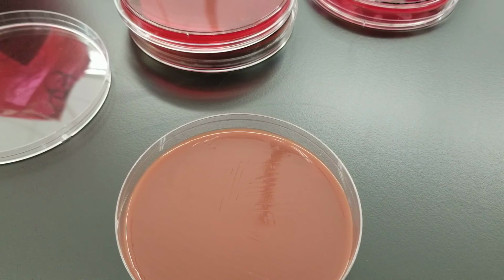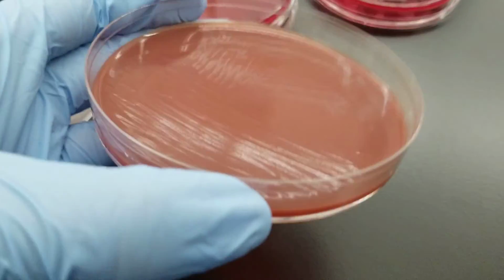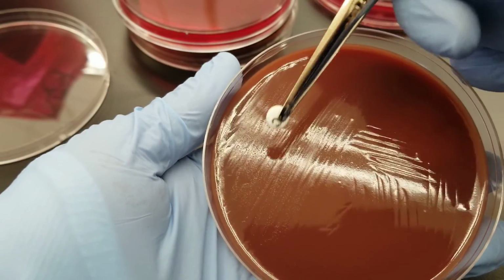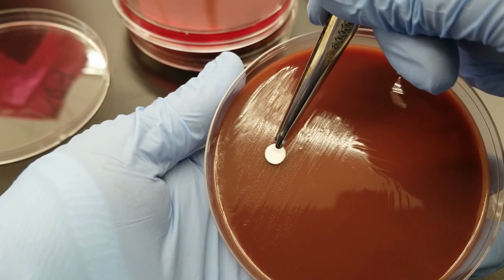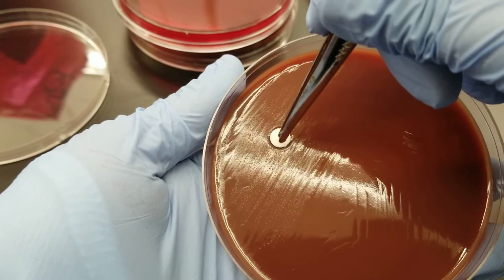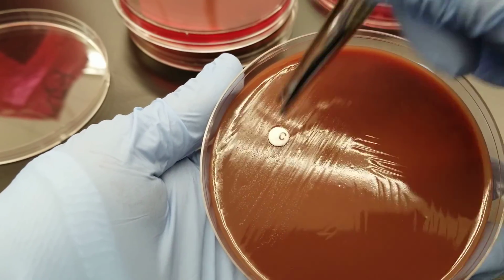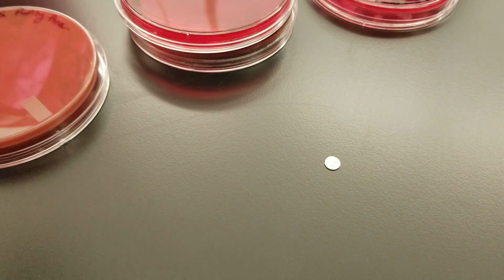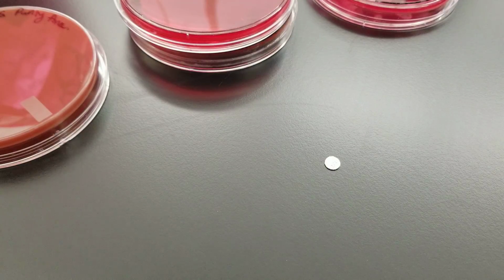into the first quadrant where all of the growth is supposed to be happening. Again, oh nuts. Again, you would put, I'm gonna clean these forceps after. You would put it in the first quadrant, and you would put all the other antibiotic discs there as well. And put them into an anaerobic bag, okay?